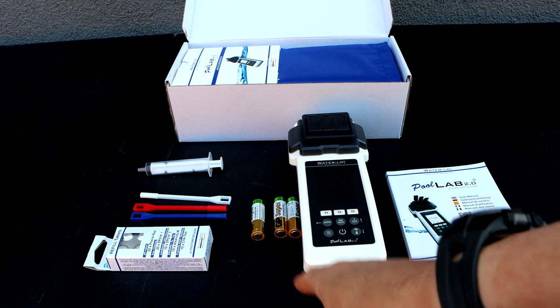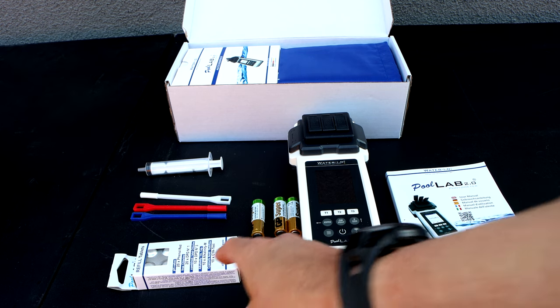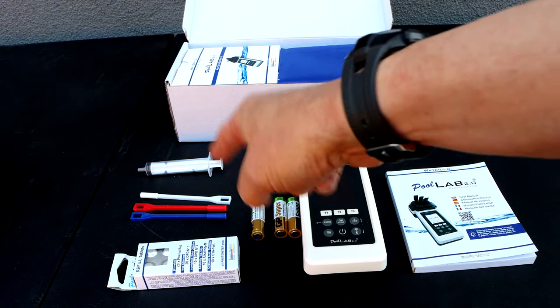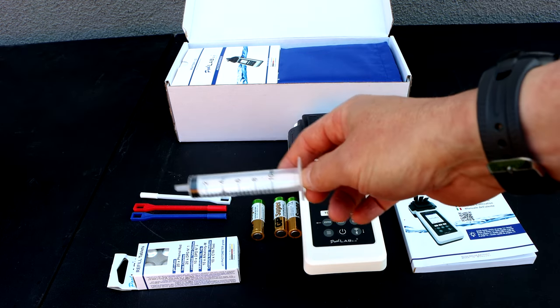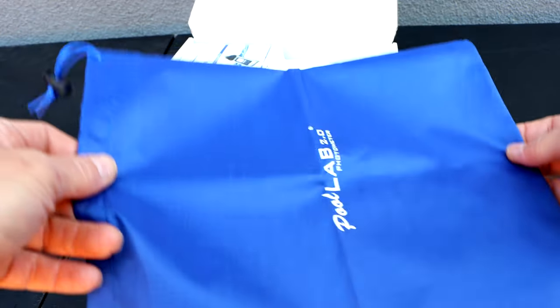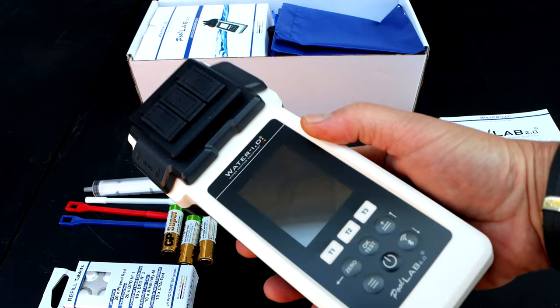In the box is the manual, the photometer itself, batteries, some tablets, three different crushers, a syringe for the water sample, and a nice storage bag.